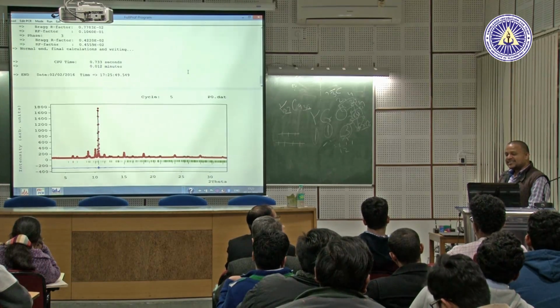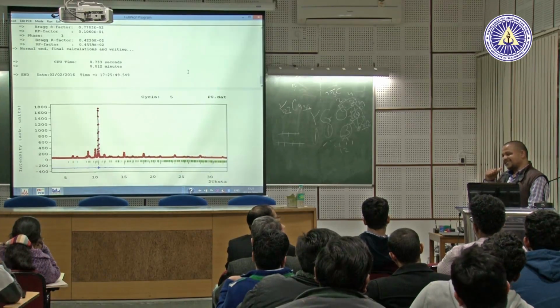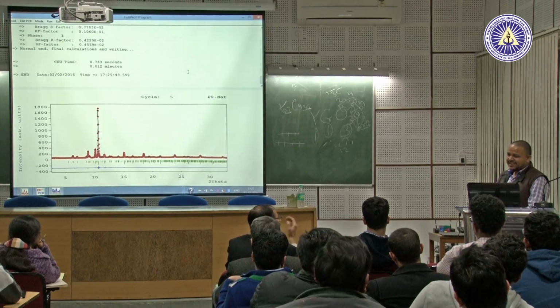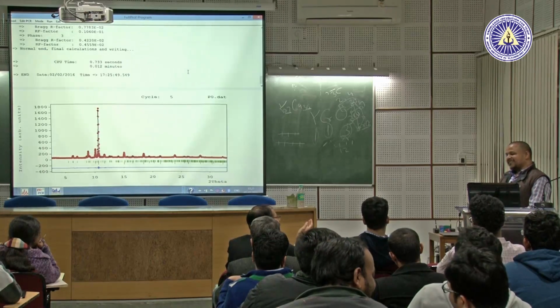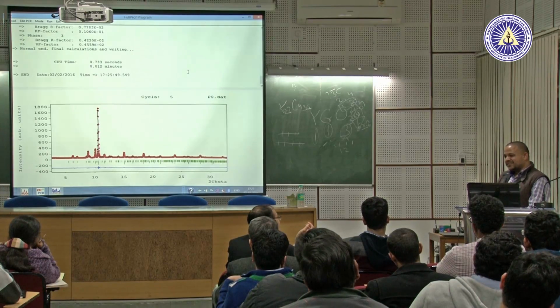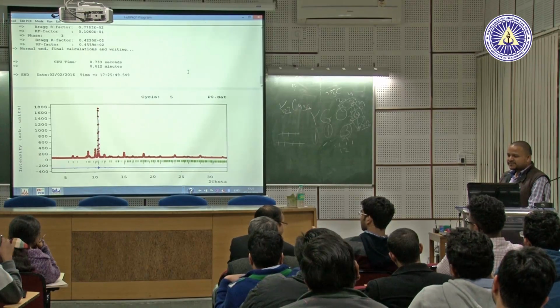I would like to mention here that Professor Dhananjay Pandey does not trust anybody. He just wants to see what your software is. And he is also saying it's not a one or two days work, it's a minimum of 10 days to 1 year. The reason is, all these softwares are so costly.